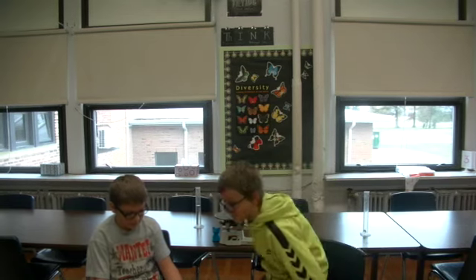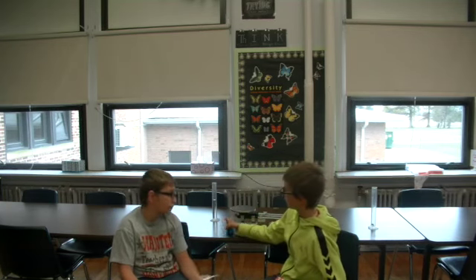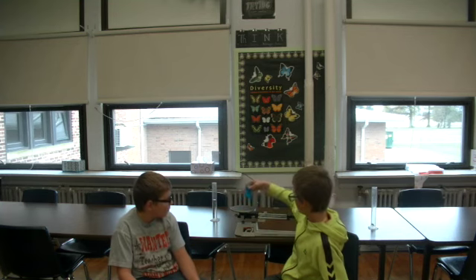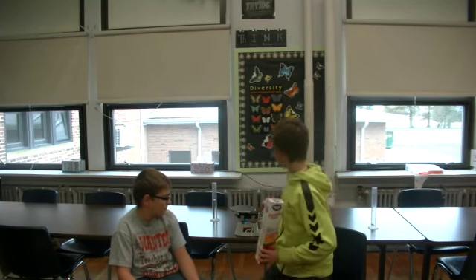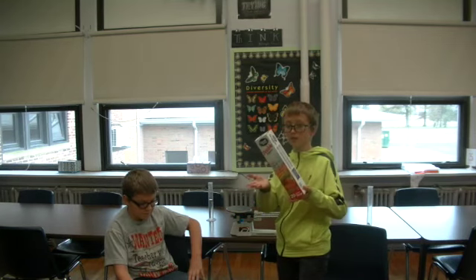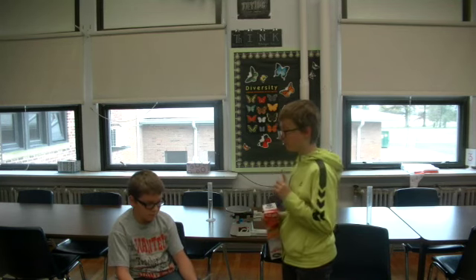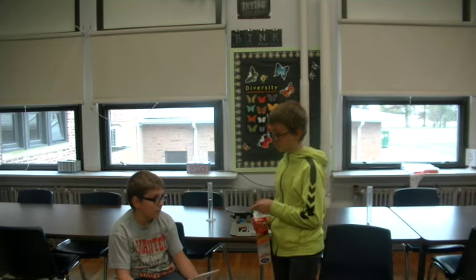Okay, so how do you find evidence for volume? Well, first, by the way, we would use grams for this. Like, this would be 20.5 grams. Remember, we always use the riders. So going back to the volume, if it's a regular shape, like a rectangle as this is, or a square, we would use the regular method and just go length times width times height. And remember, volume is always measured in centimeters cubed.